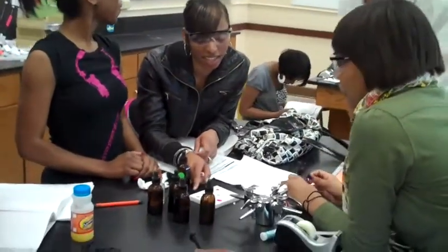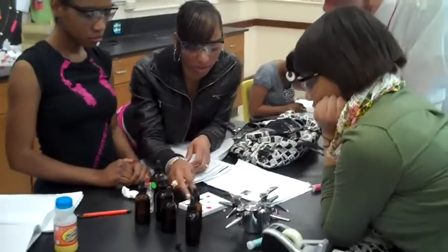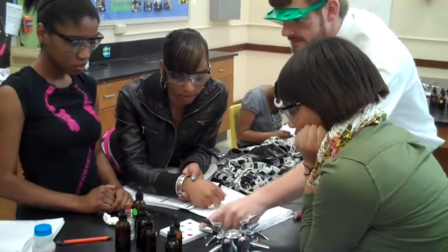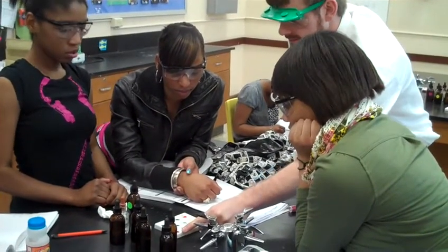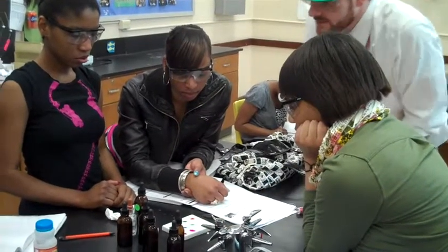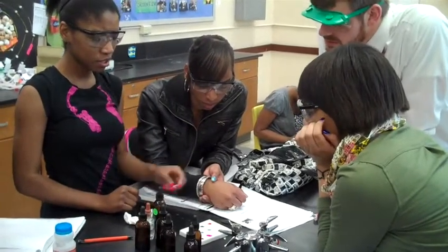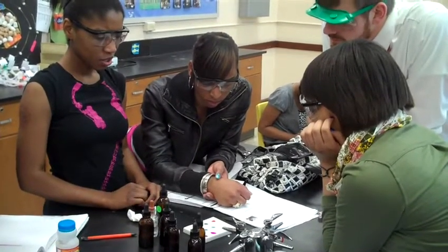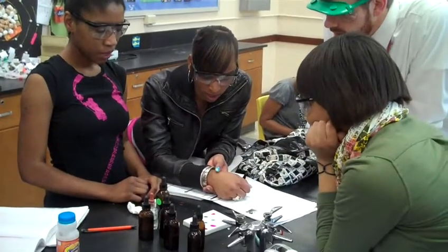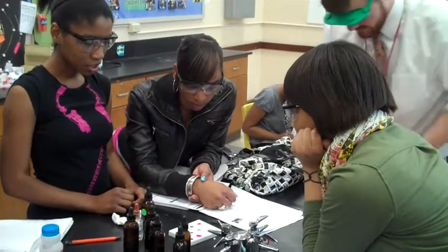So what do we think it is over here? A base, because these colors basically match the base's colors. So this is your base here? Yeah. And this is your unknown. Okay, so Jessica, why do we think the unknown's a base? I guess because it's the same color, but those two are not the same color. Which two? Oh, never mind, it's not a base. These two look like two different colors. Interesting. Maybe, well, let's see.